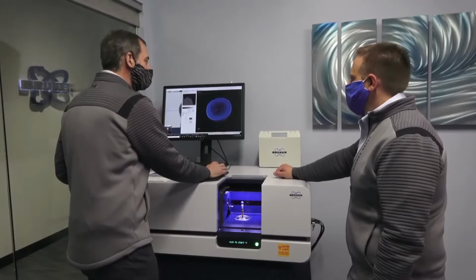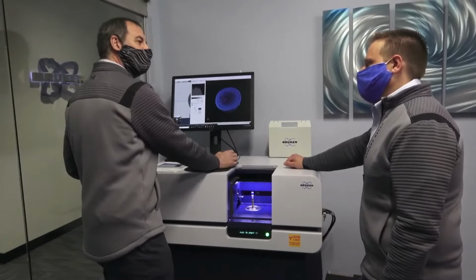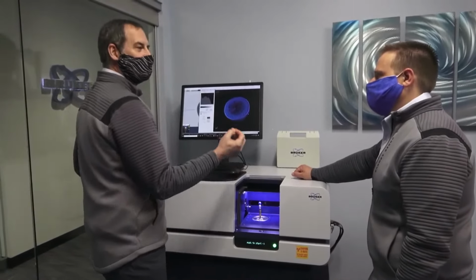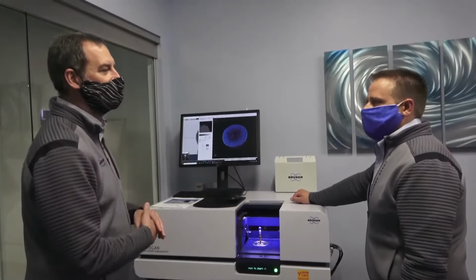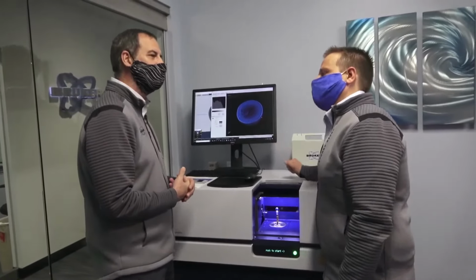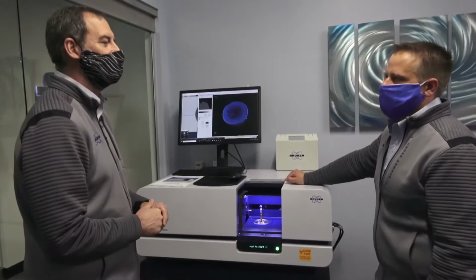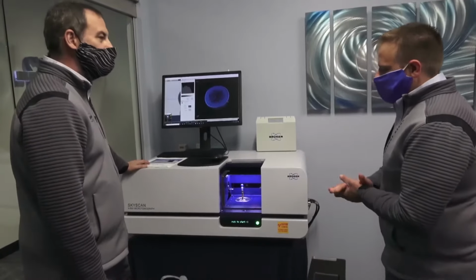I can do statistical analysis. I can tell you exactly what the thickness of this coating is, what the average thickness of the coating is, all that, which is key information to feed back into the system. Okay, so you can get the thickness of different things, the size, the number of the pores, things like that. Correct. From this technique.